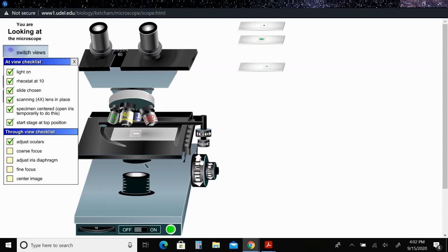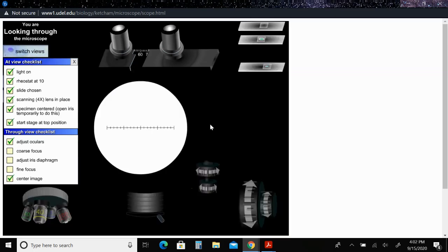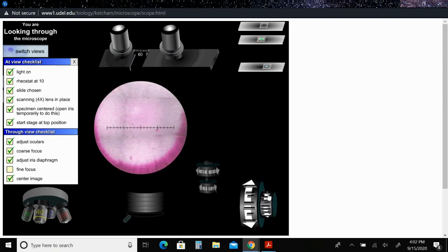Okay, raise my stage. Okay. And we'll center our red dot.